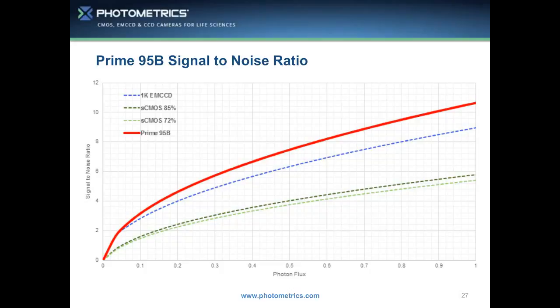How does the read noise compare to that of the Evolve 512? The read noise of the Evolve 512 without EM gain is about 50 to 70 electrons, but with EM gain you're able to reduce that effectively to less than 1 electron proportionally. The Prime 95B is able to get you a read noise of about 1.3 electrons. So quite close. While EMCCD cameras have the advantage in the raw read noise value, the CMOS technology offers read noise right around the levels of 1 electron.